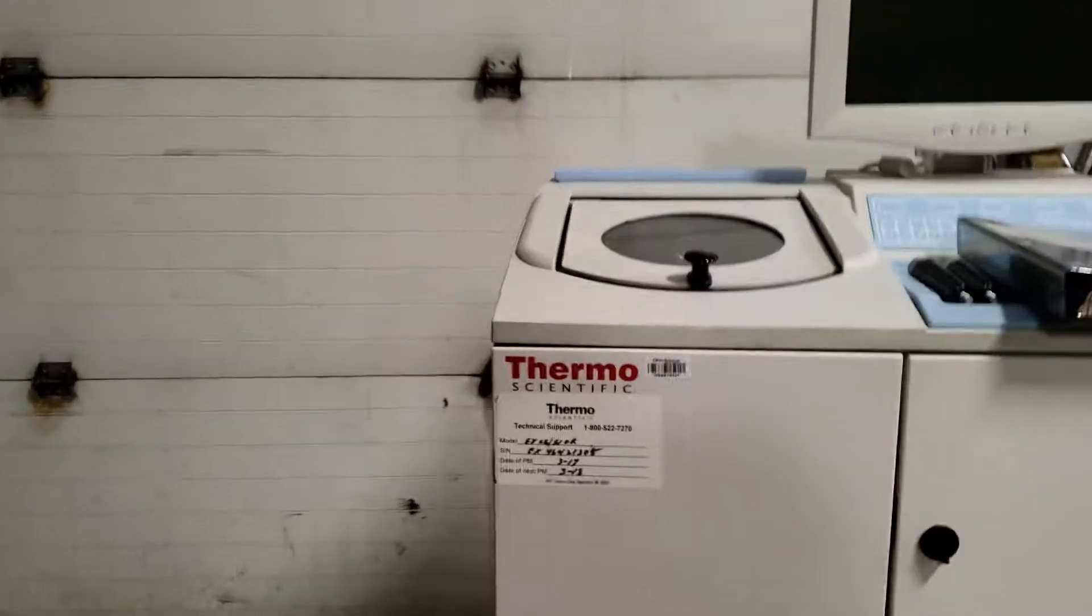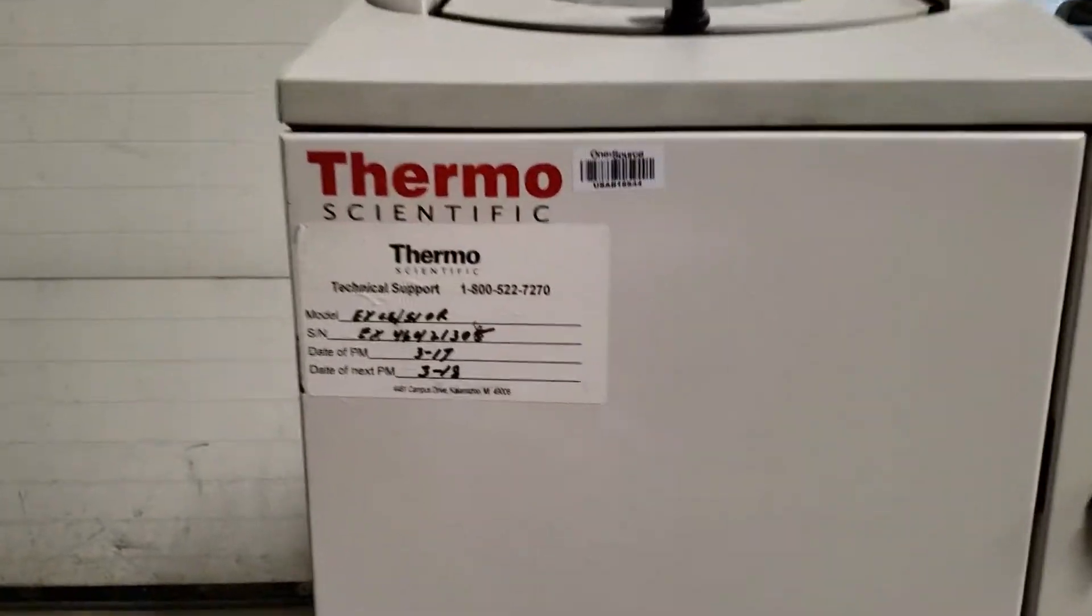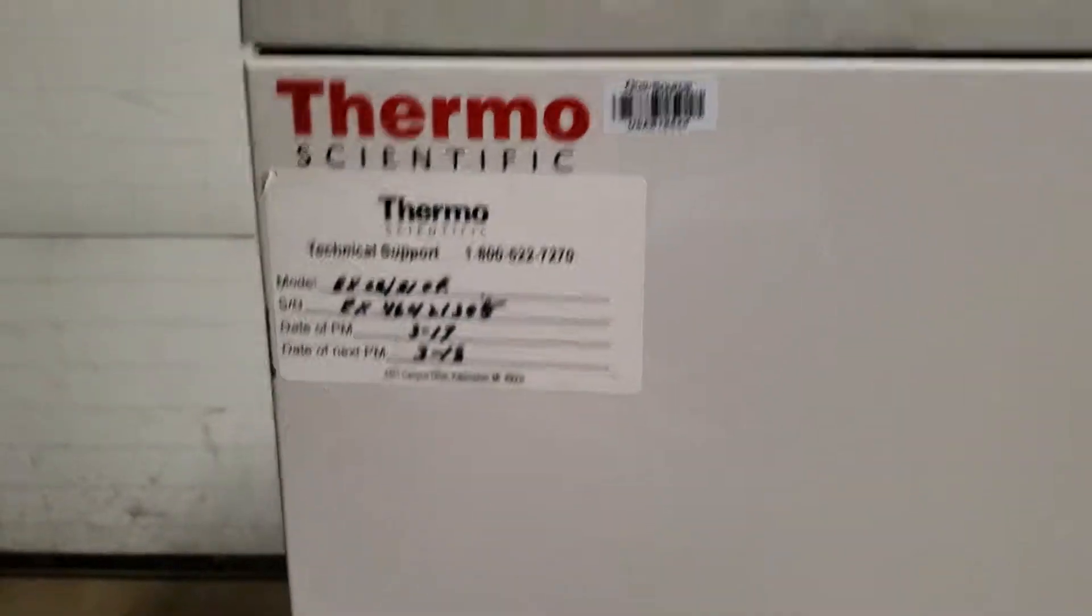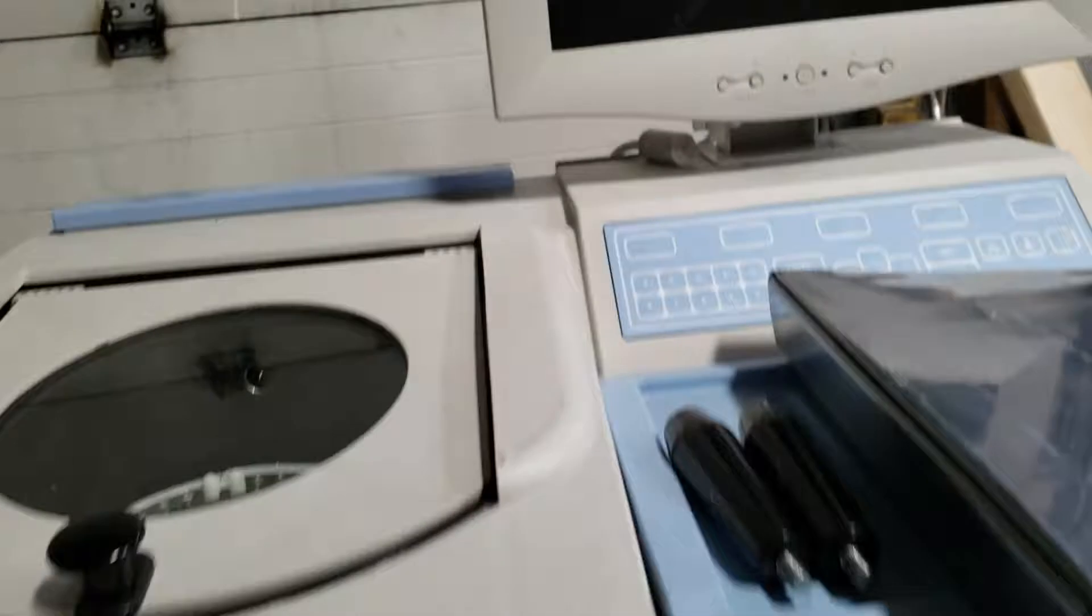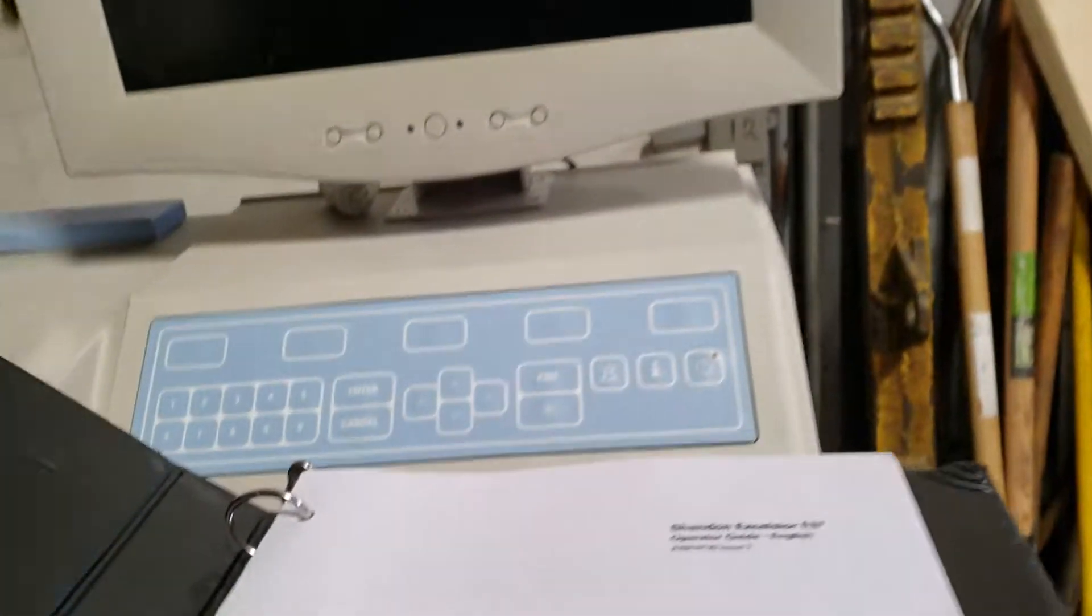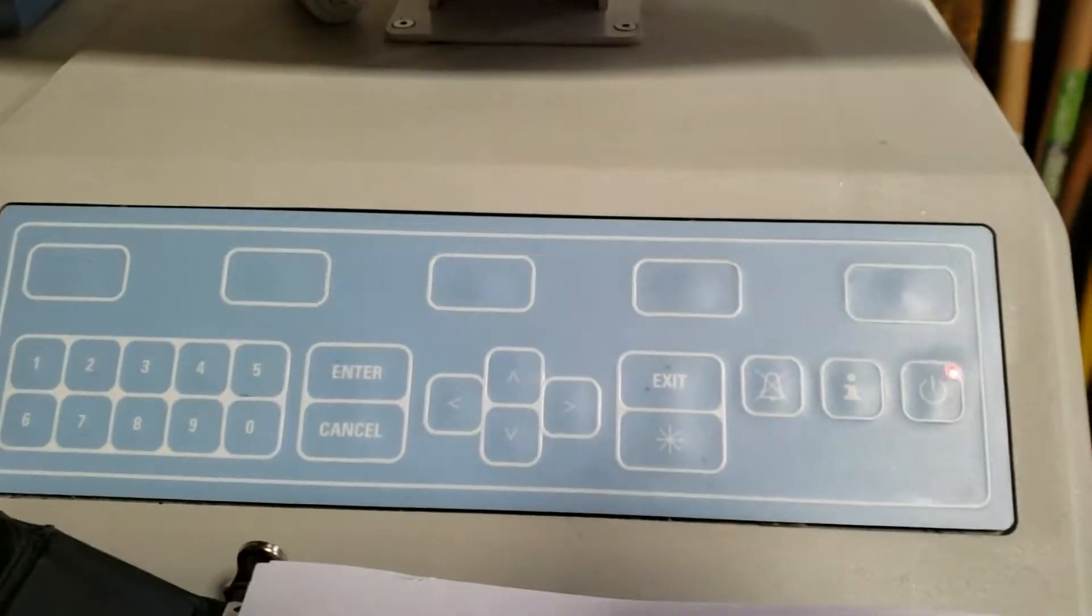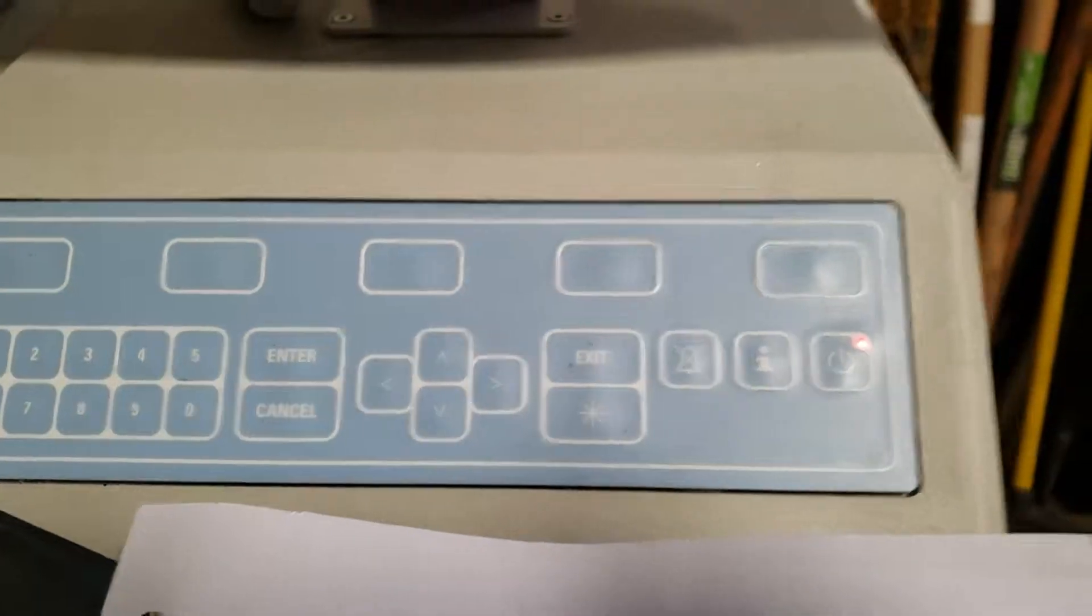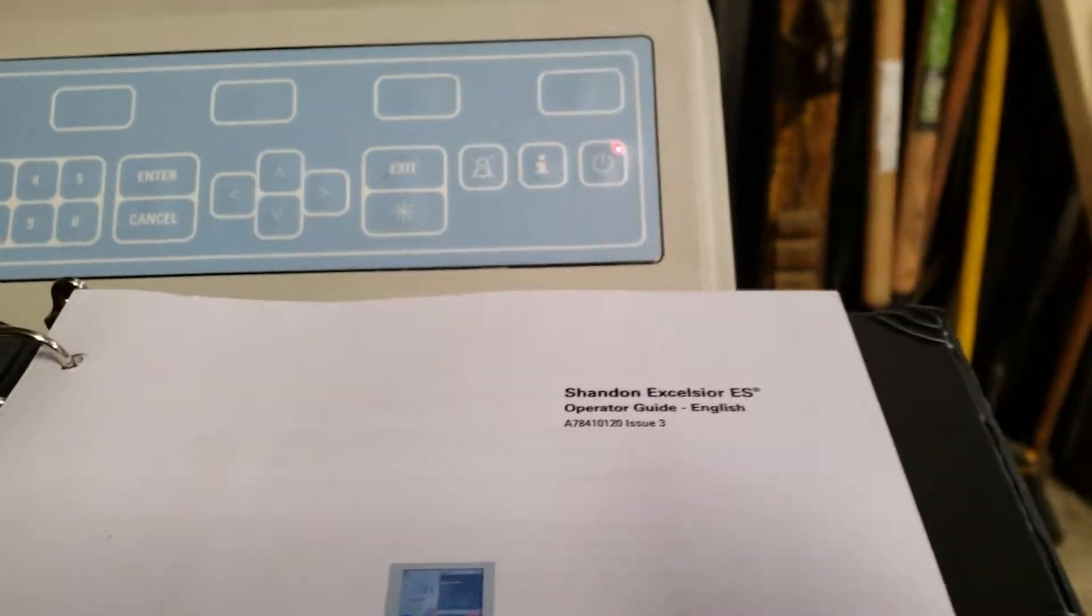This is a Thermo Scientific Excelsior ES tissue processing machine. I just booted it so you can hear it. There's the self-test pad.